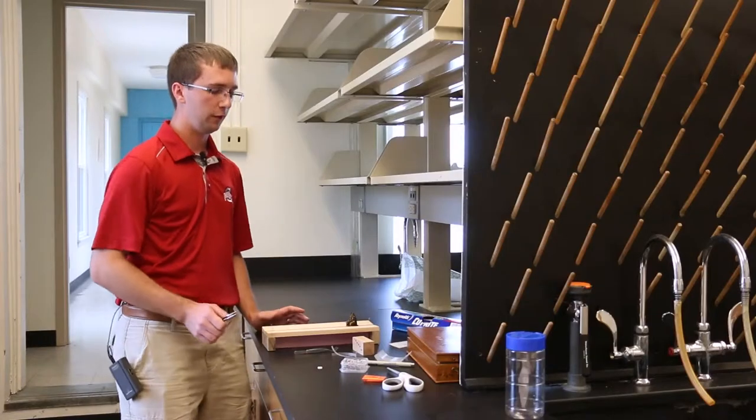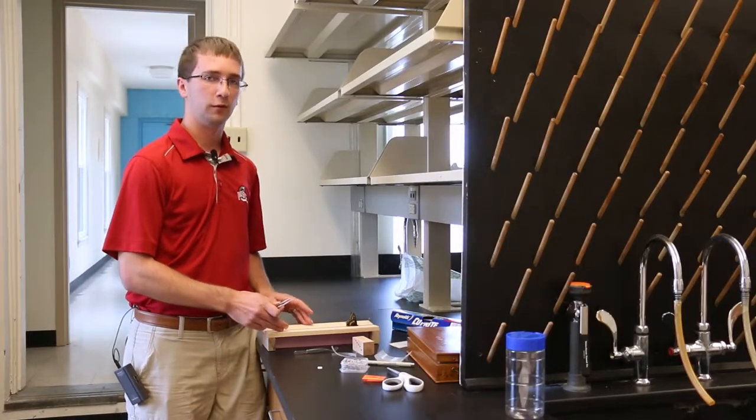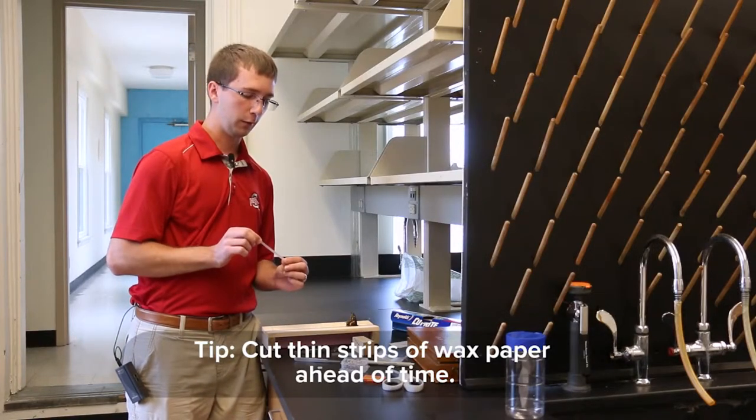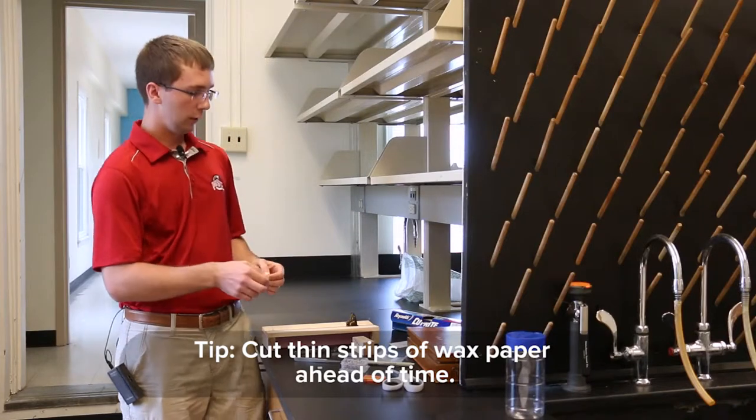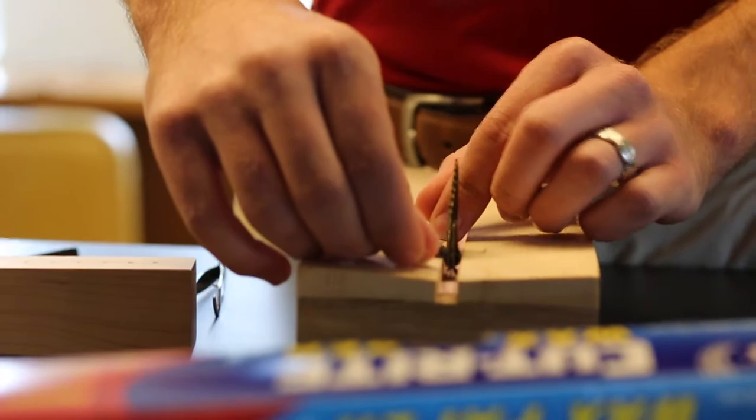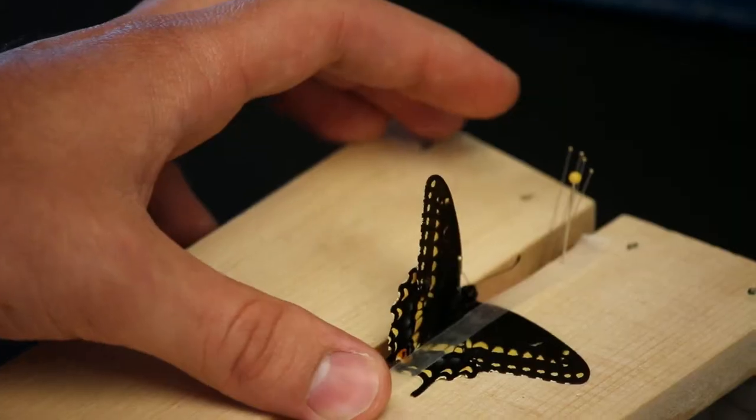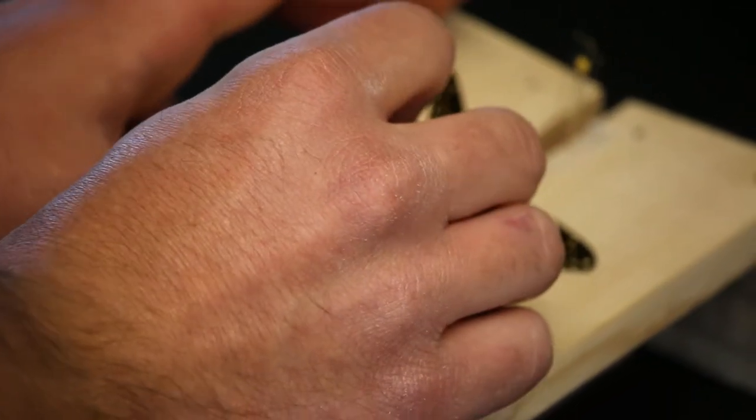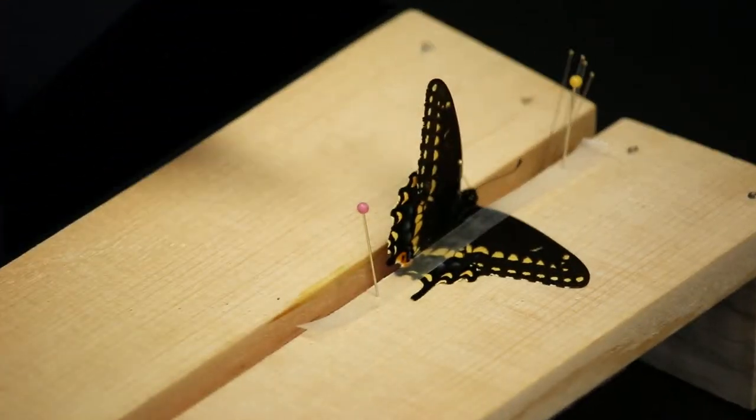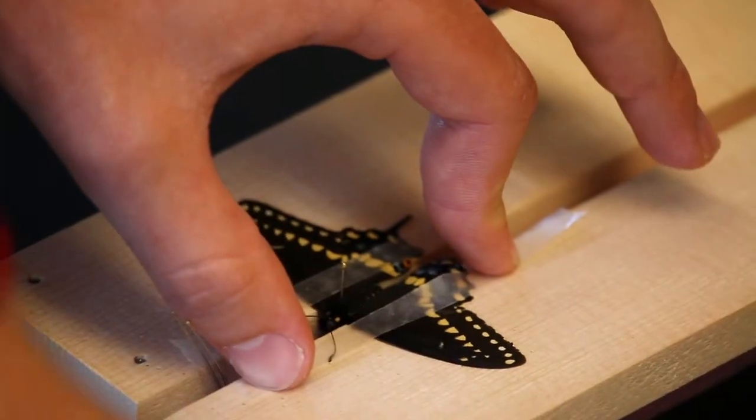After the wings are at a level surface with the spreading board, I take a very thin strip of wax paper and lay it on one side of the wings to hold the wings down. Then I take a couple sewing pins and pin the wax paper to the spreading board. I do the same thing with the other set of wings. As you can see, this process can take a little bit of time.